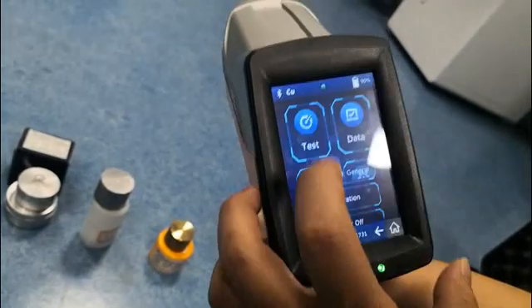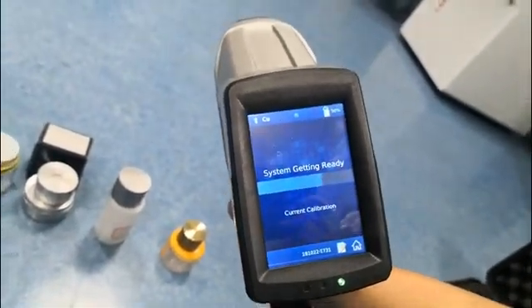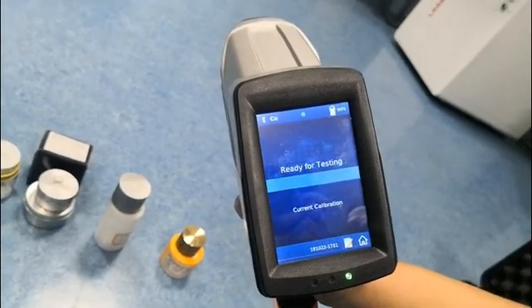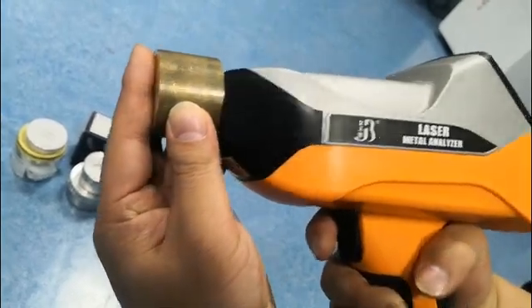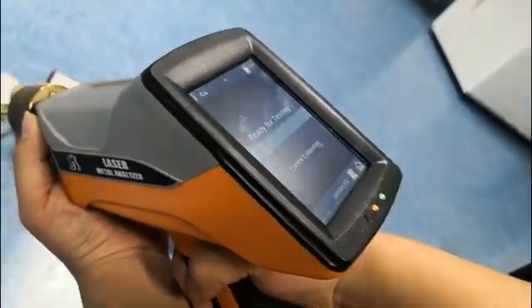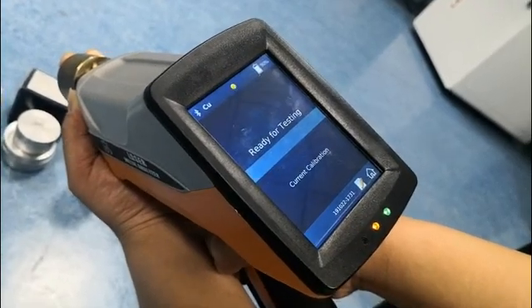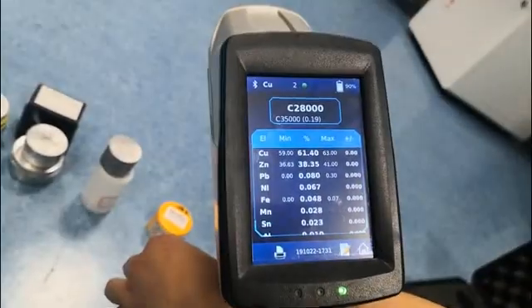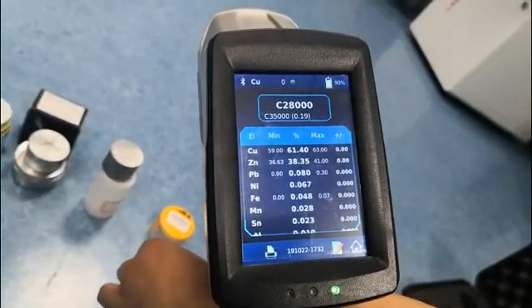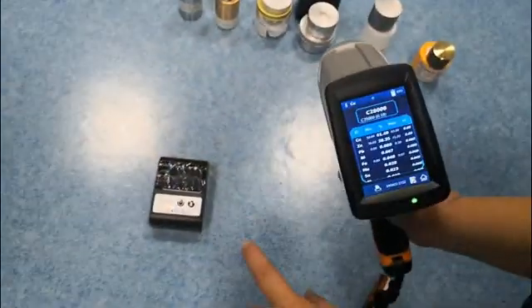In quick mode test it will get the result really soon. Okay, this is a copper standard sample — we put it here. This is C28000.